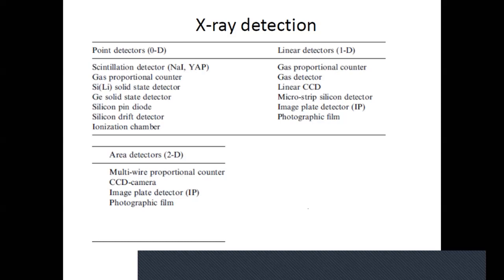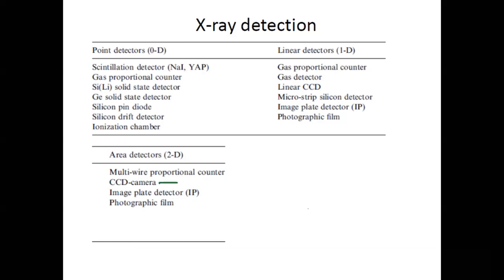And in our older machine, we have what's called a CCD detector. In our newer machine, it counts directly the number of photons that strike the surface of the detector. So we'll just spend a little bit of time explaining the difference in the types of detectors.